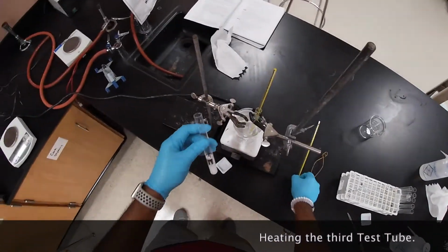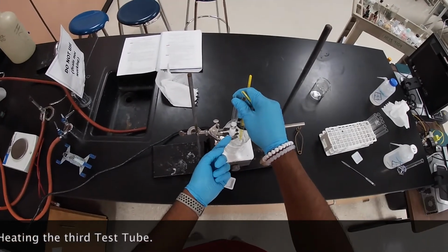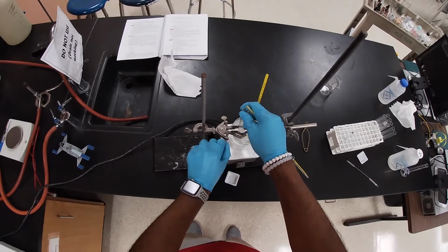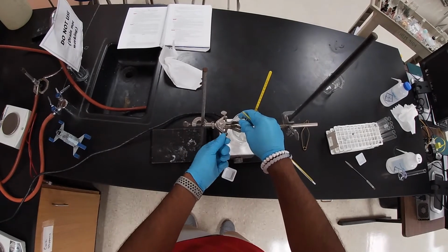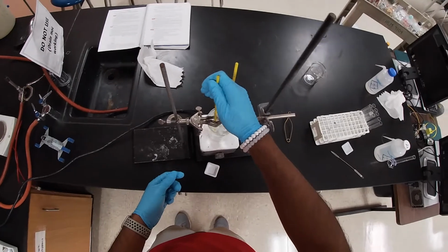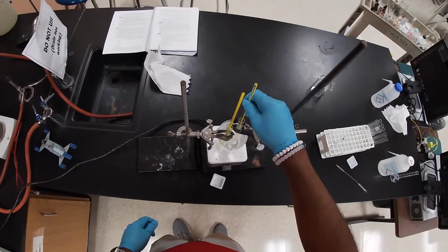Okay, so now I'm gonna do my setup. I have both of them heating at the same time. So here I have my 5-gram, and here I have my 4-gram one. So I'm gonna go ahead and start heating this one. I'm gonna completely submerge it. Make sure that it's tight so it doesn't slip down to the bottom. And I'm gonna go ahead and stir both of these at the same time so that it can start dissolving.